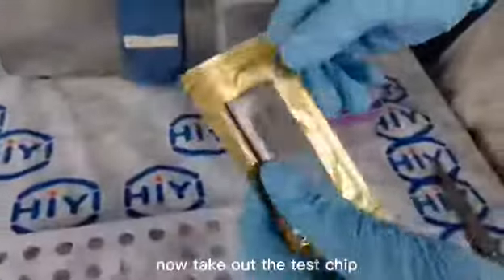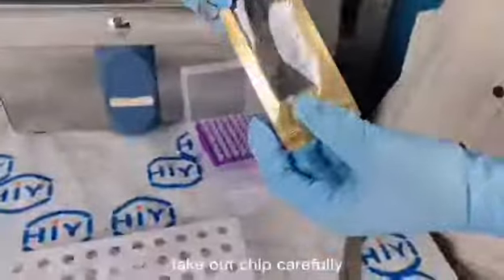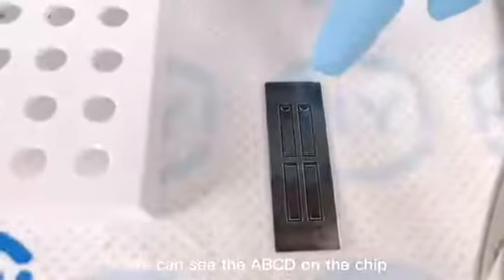Now take out the test chip. Take out the chip carefully. We can see the A, B, C, D positions on the chip.